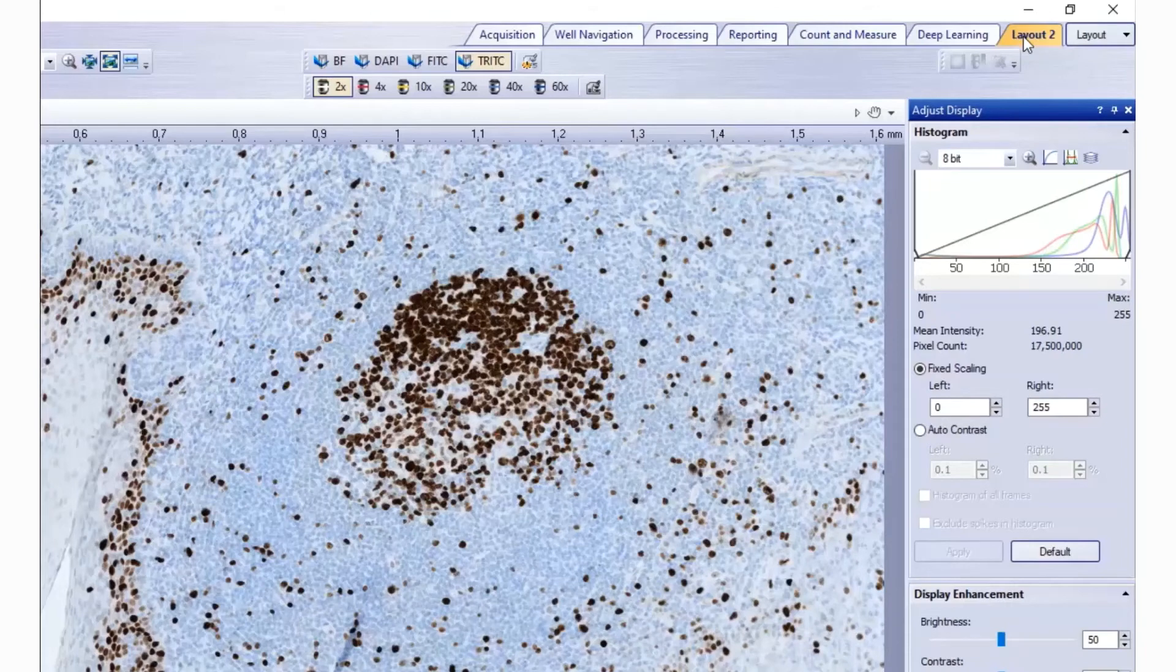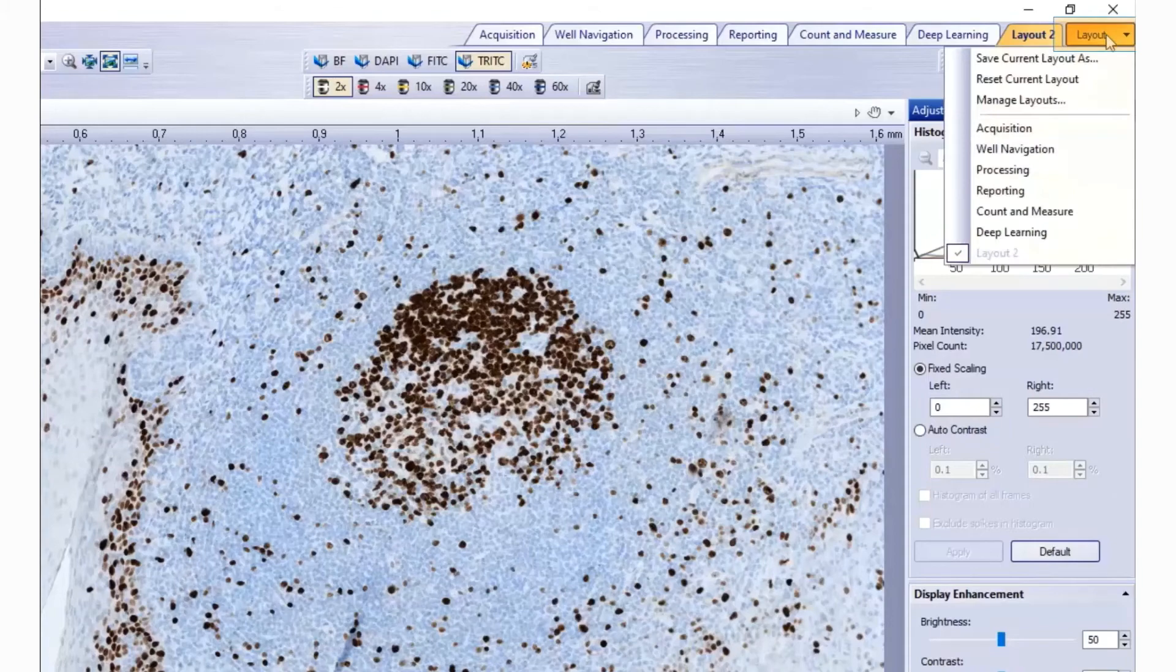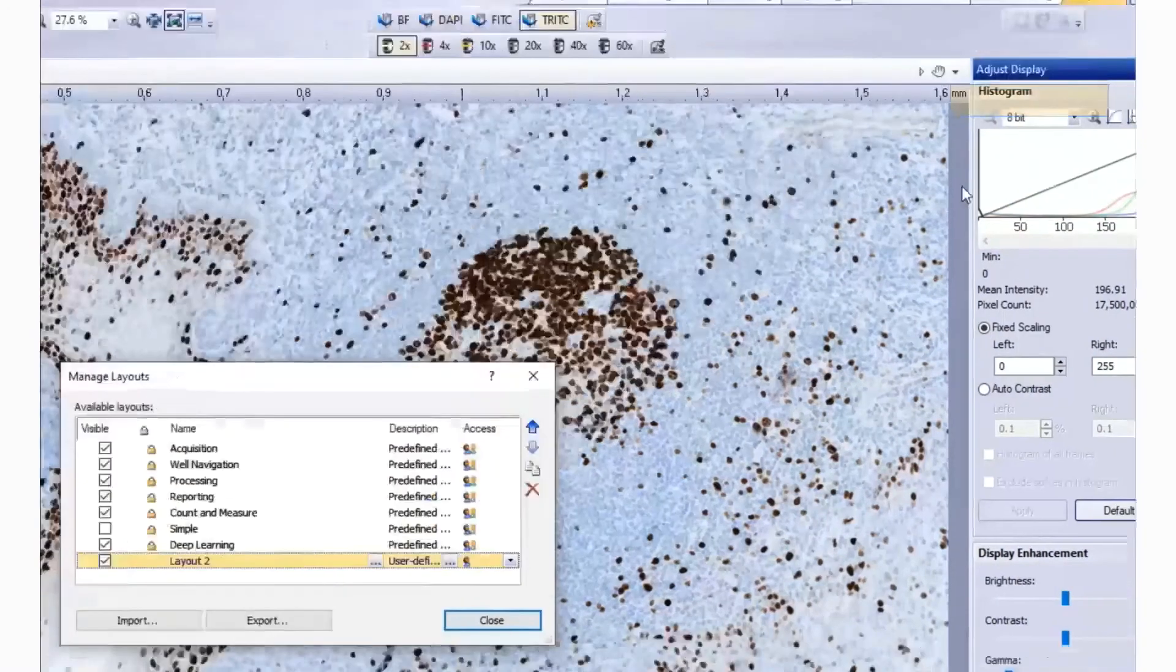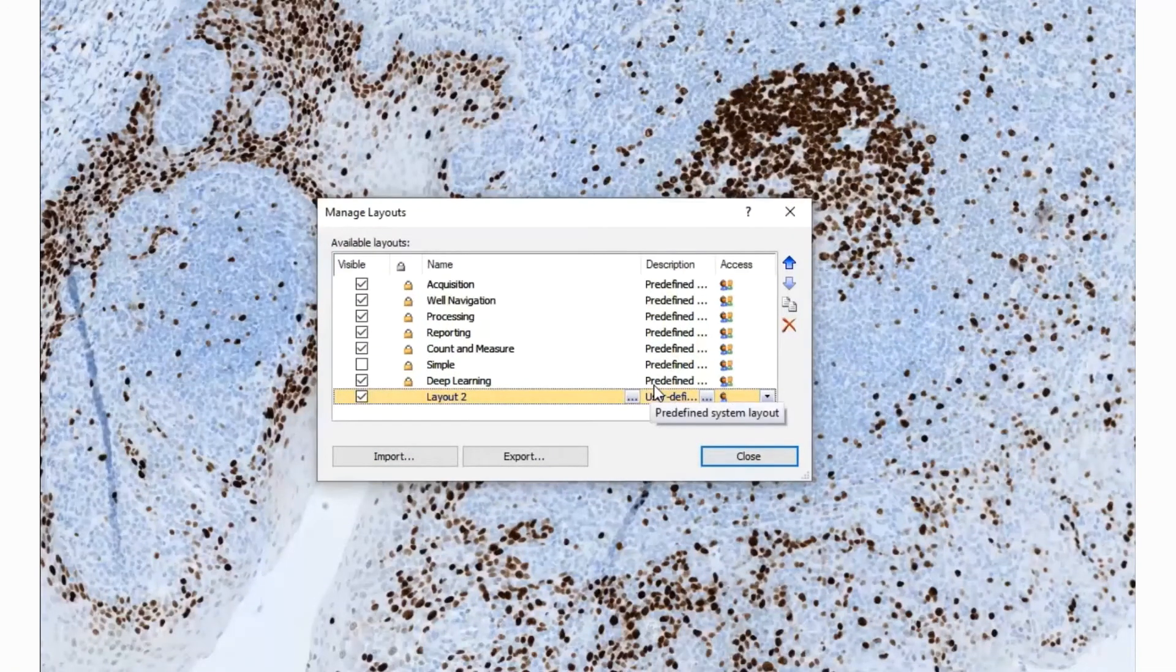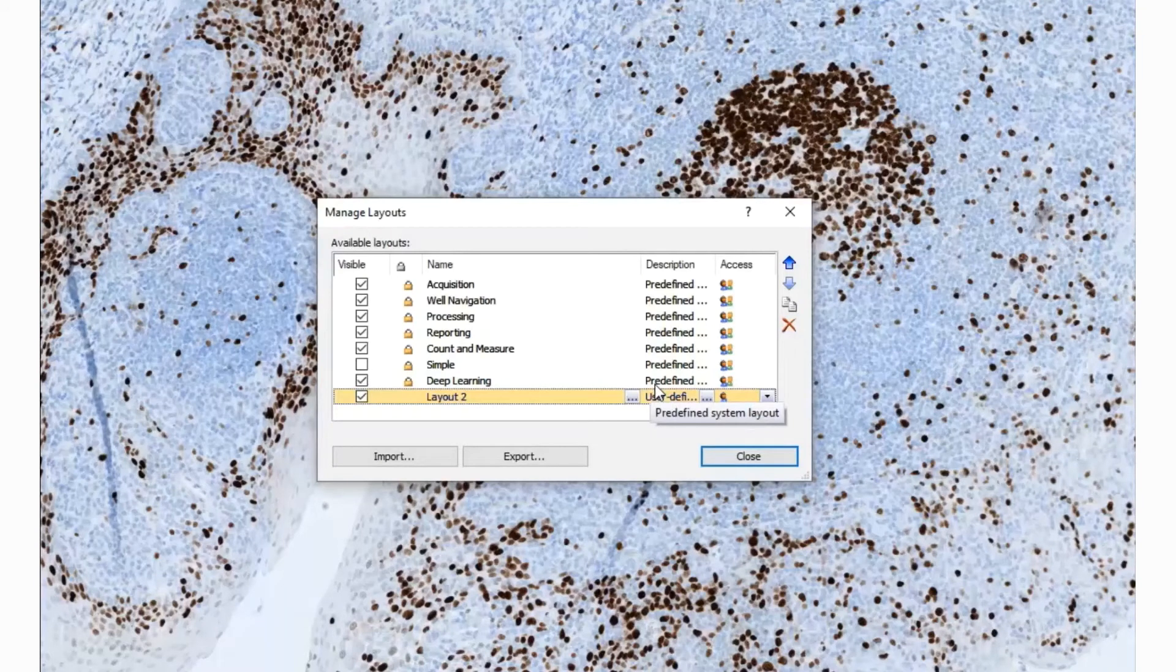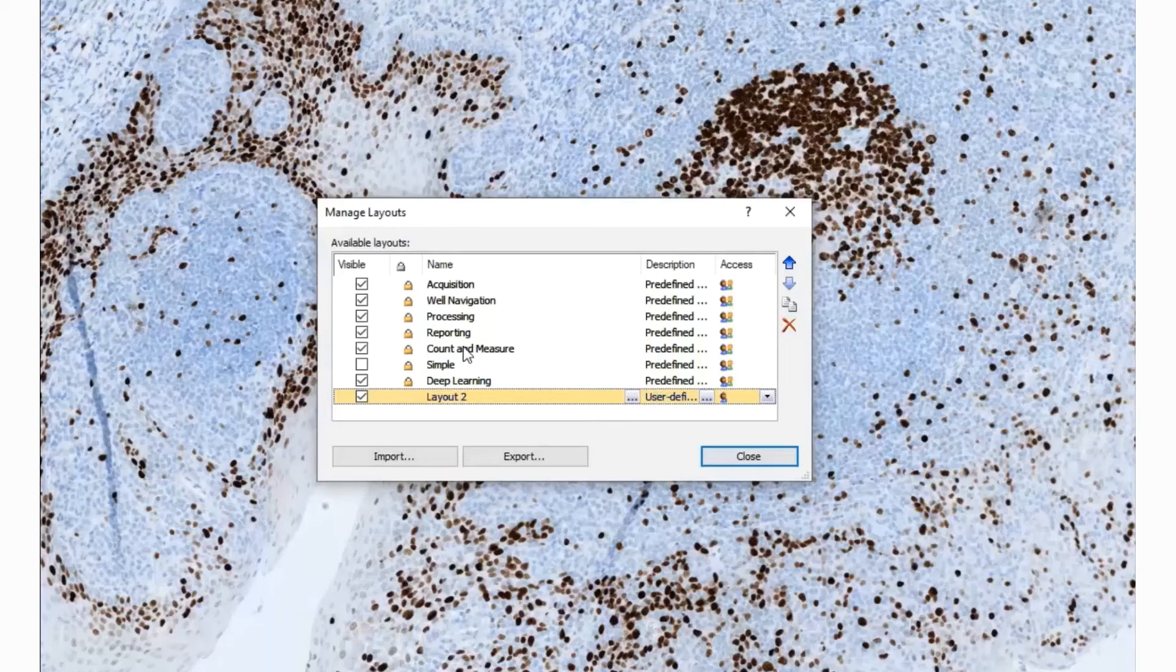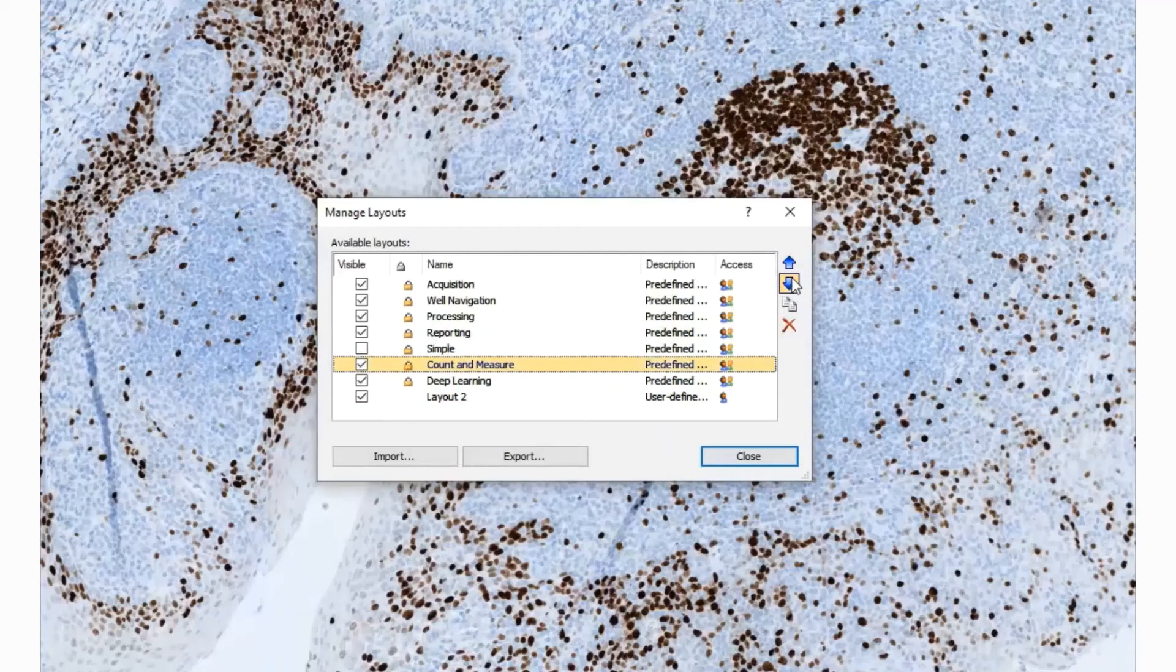To enable or disable interface layouts, go to Layout, Manage Layouts. Layouts that have a checkmark next to them will be displayed. To change the order in which layouts are displayed, simply select a layout and hit the up or down arrows.